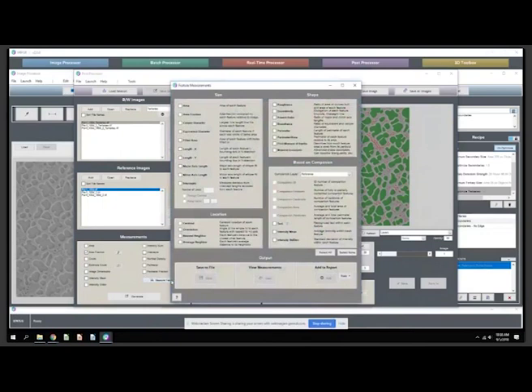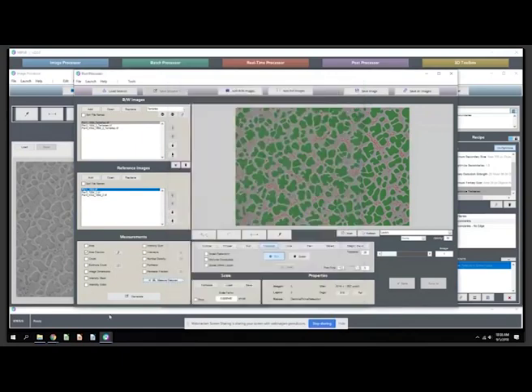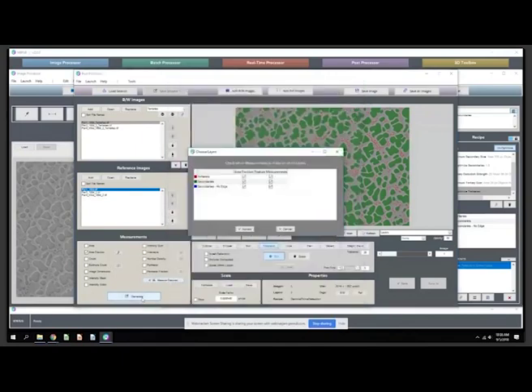And again, combining feature measurements with this list of globals into one comprehensive report is a big step that we've taken in 2.0. Let's check off the caliper diameter and the average neighbor distance. We'll say add to report. And then when you click generate, just choose what you want to measure on what. We'll measure the area fraction on those two and the feature measurements on the fully contained secondaries.